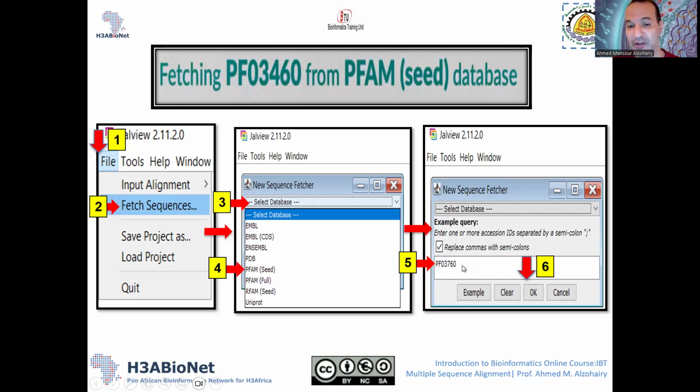If you have more than one sequence, if you have a big multiple sequence alignment, you can put more. Just separate them by semicolon, as we said before. So you can choose 1, 2, 3, whatever, 10, so you will have multiple sequence alignment sequences. We just put here as many sequences as needed for our research, separate them by semicolon, and then press OK, as we can see.